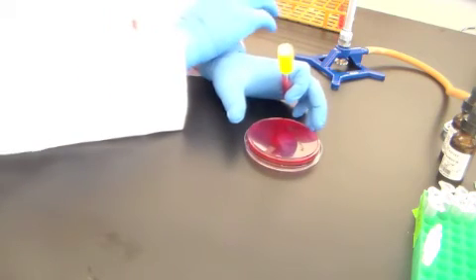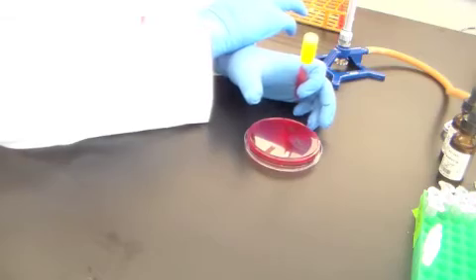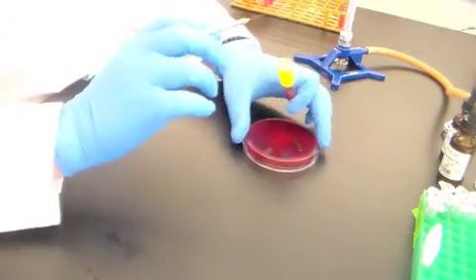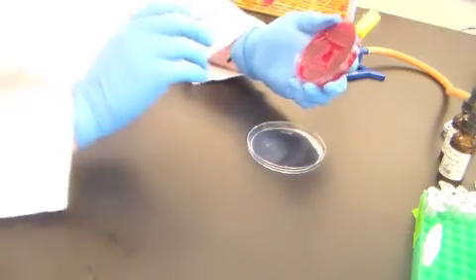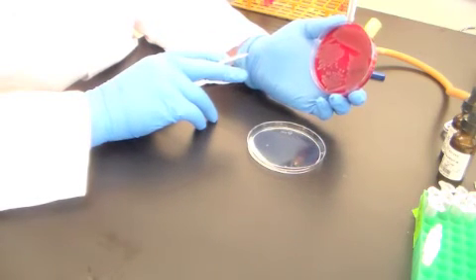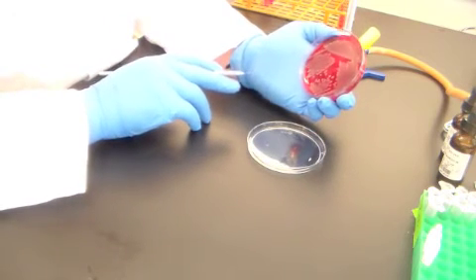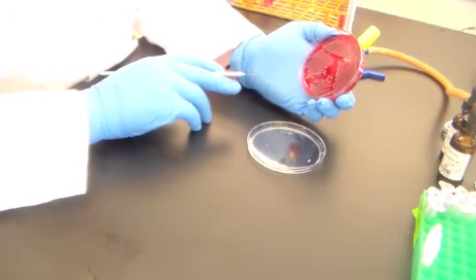So what you're going to do is, with a sterile needle, you're going to take the prescribed bacteria. This is Salmonella enterica. And this points out the fact that you are going to be dealing with human pathogens at this point. Pretty frank, pretty severe human pathogens.